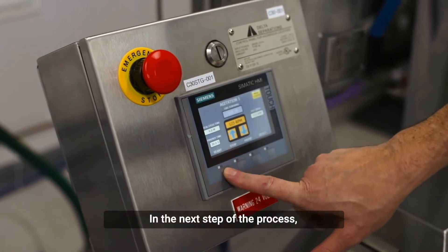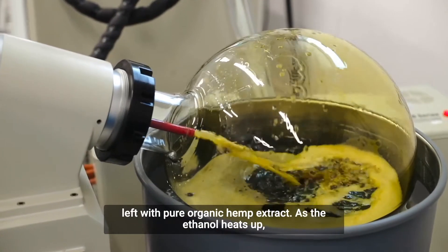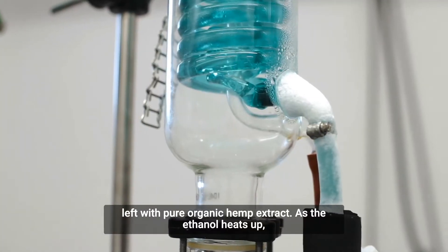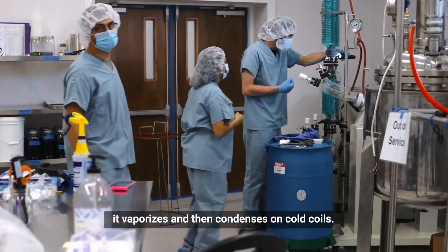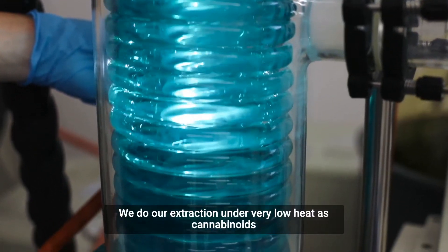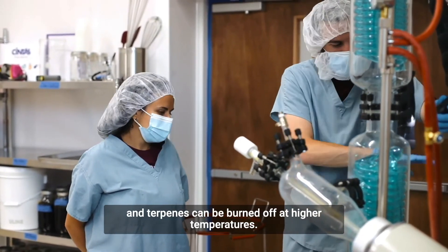In the next step of the process, we remove the ethanol by slowly heating it so that we are left with pure organic hemp extract. As the ethanol heats up, it vaporizes and then condenses on cold coils. We do our extraction under very low heat, as cannabinoids and terpenes can be burned off at higher temperatures.